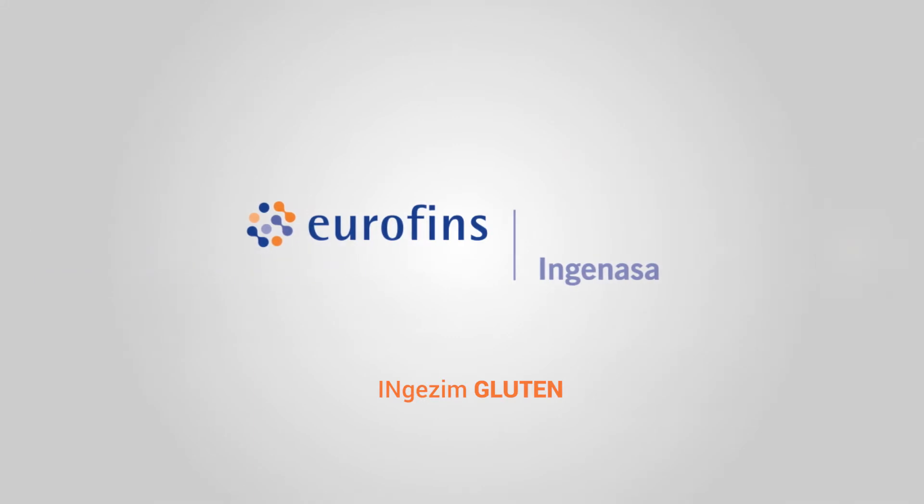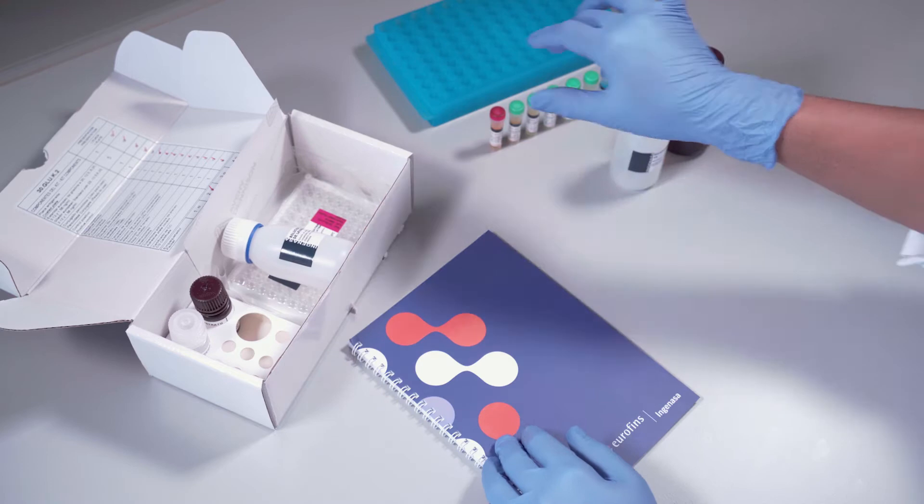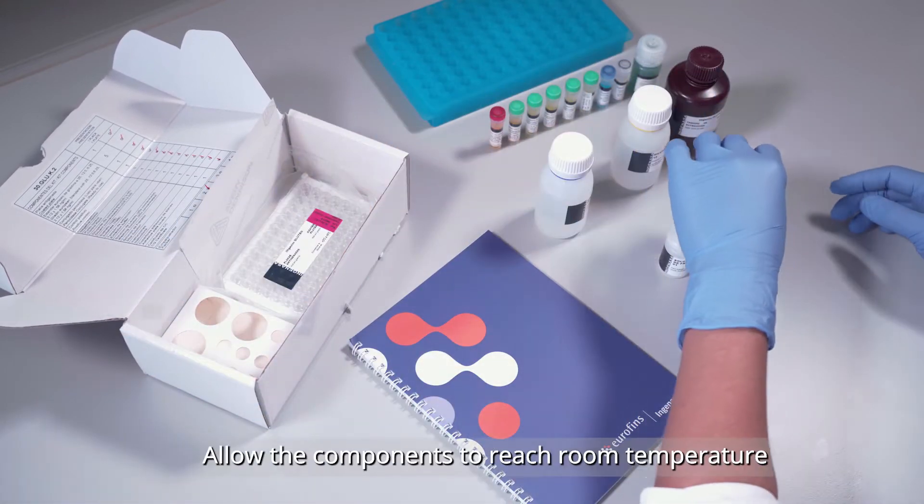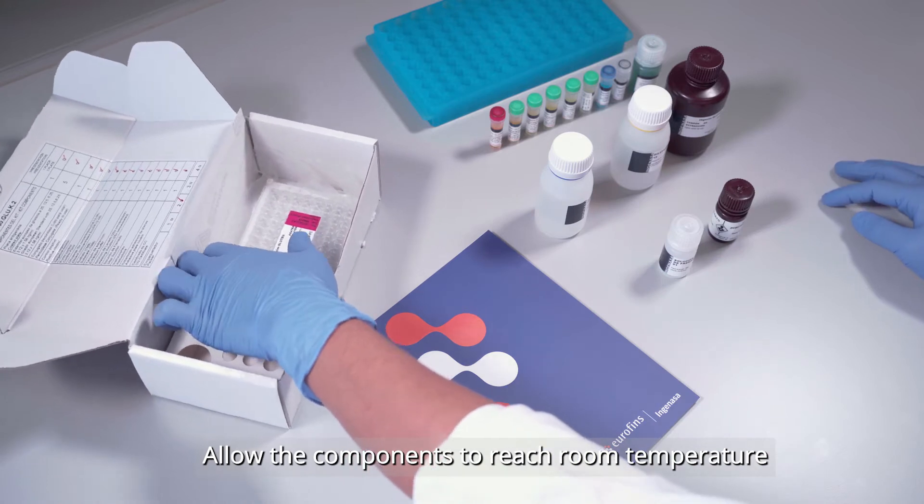IngeSim gluten is an ELISA based on the R5 monoclonal antibody for the detection of gluten in foodstuffs and environmental samples. Allow the components to reach room temperature.